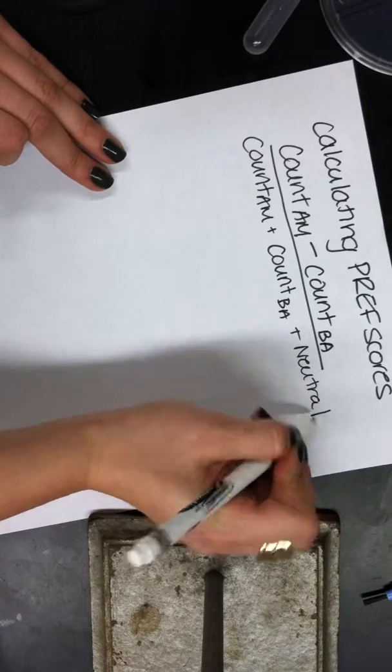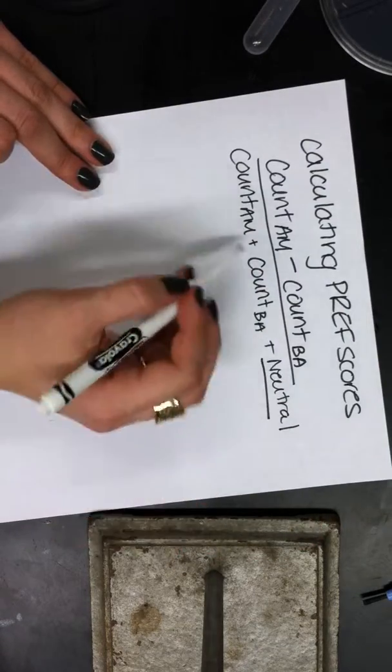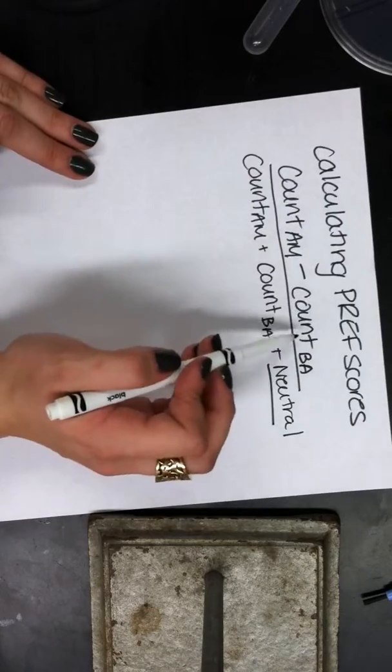So if any stay on the line, they'll count it as neutral. So it's really count AM minus count BA over total.